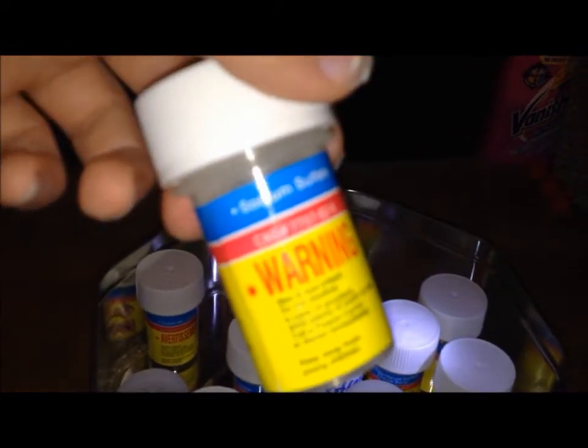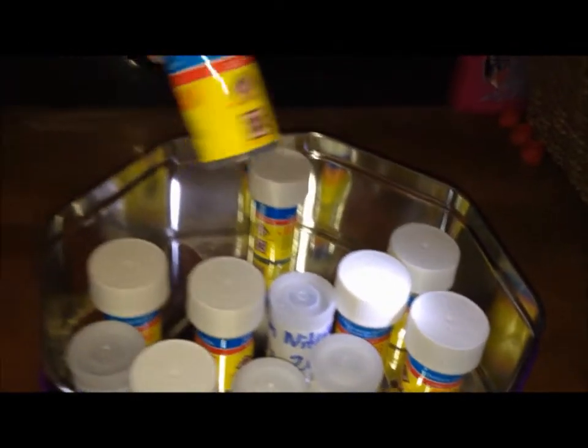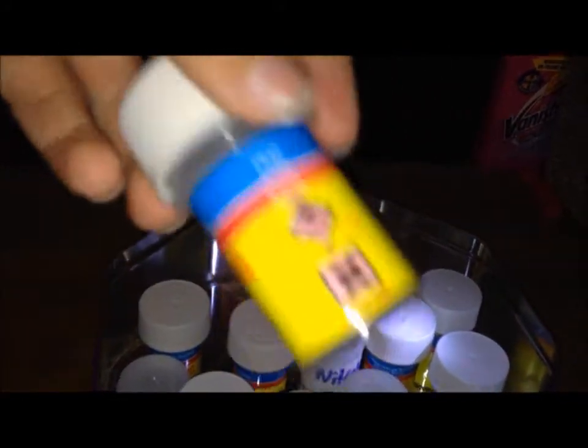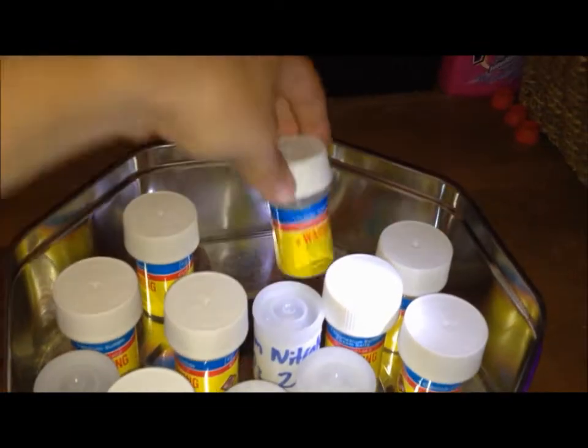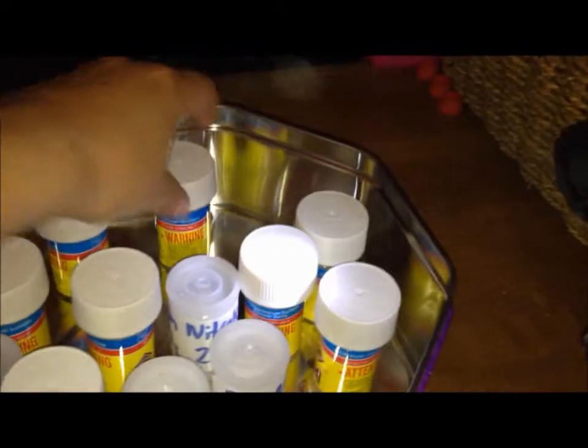Sodium sulphate — you can make that yourself quite easily. Copper oxide, useful — you can make thermite and stuff like that. And finally copper sulphate, a lovely blue crystal that you can make crystals with.